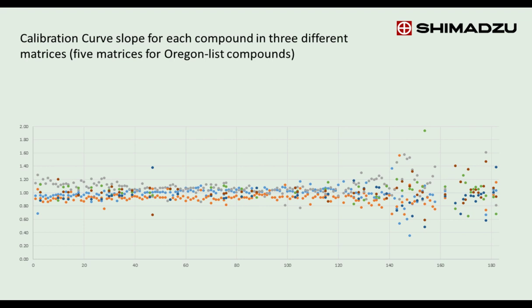And just if anyone's interested, for this analysis we used one strain that was Dutch Treat, one strain that was Orange Kush, and there was a third strain that was a composite of several different strains.